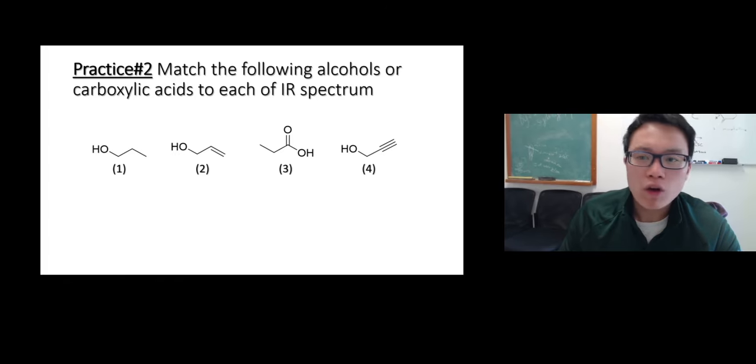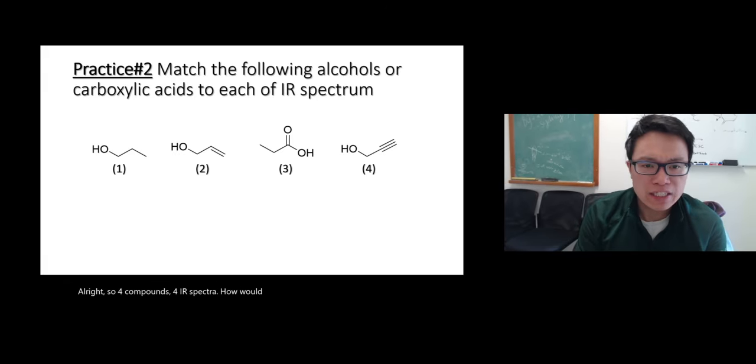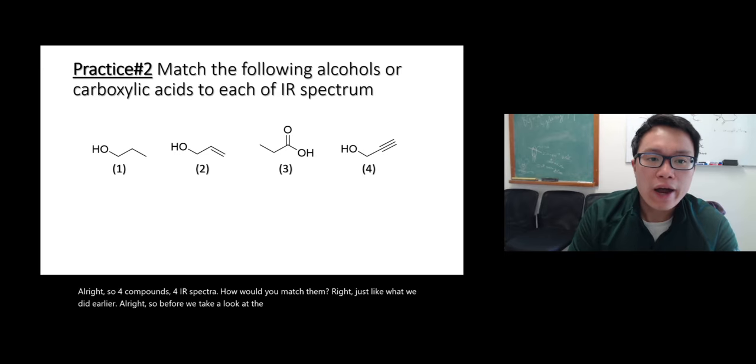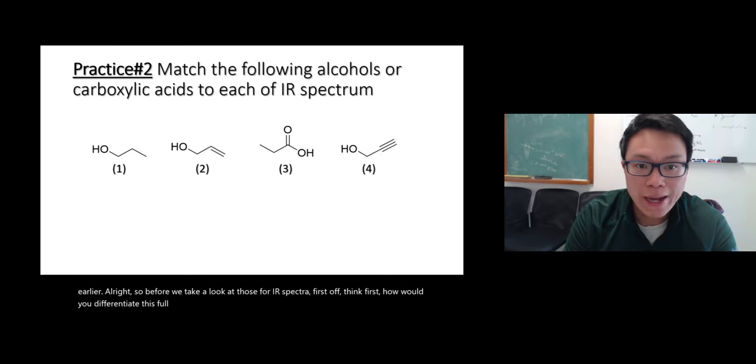All right, so four compounds, four IR spectra. How would you match them? Just like what we did earlier. Before we take a look at those four IR spectra, first off, think first. How would you differentiate these four compounds using IR spectra?